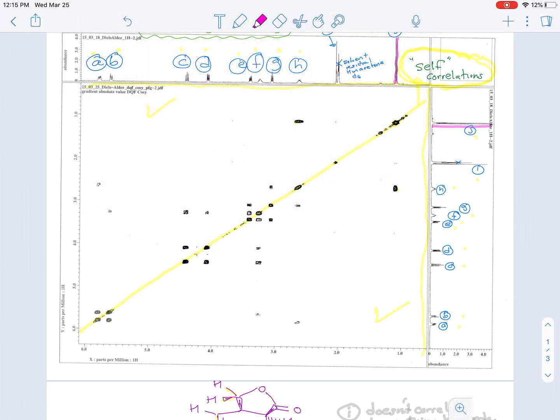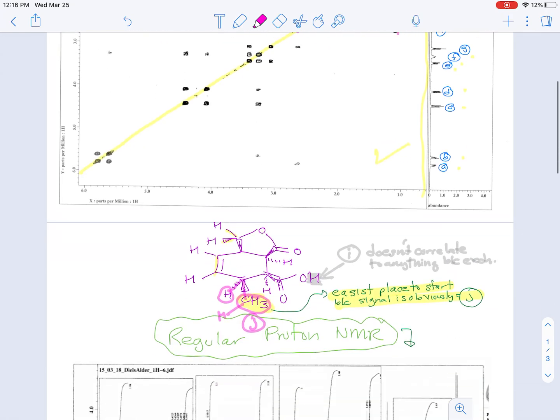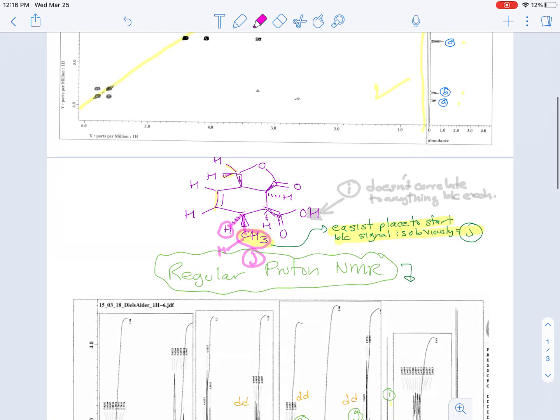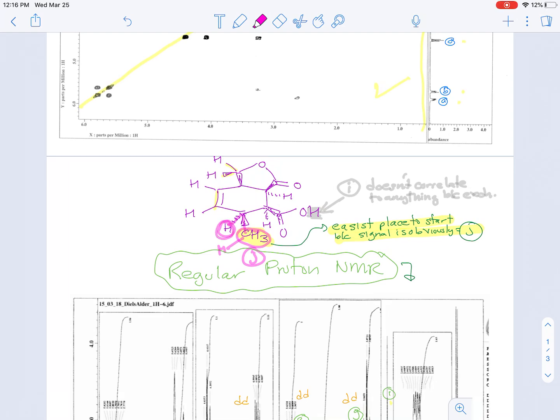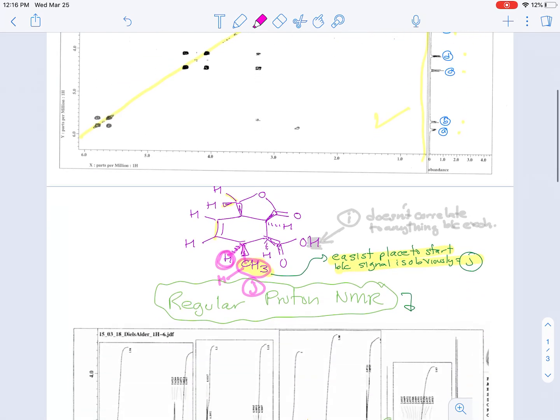What some people like to do is actually make little correlation boxes that use the diagonal line signals and the correlated signals. So we're going to follow signal J down. You can see that signal J correlates to signal H. And again, we can make this nice little box. So this is showing that J correlates to H. And since the only proton within three bonds of the methyl group is this methine, this therefore must be signal H.